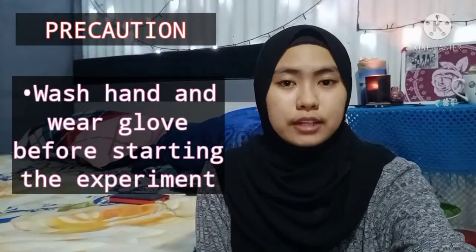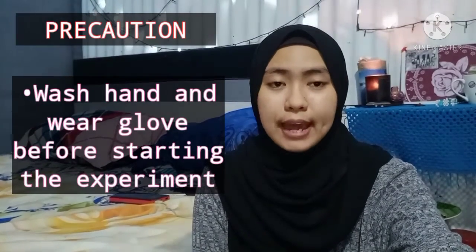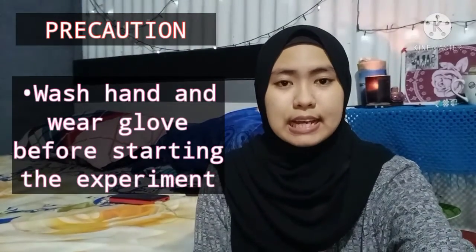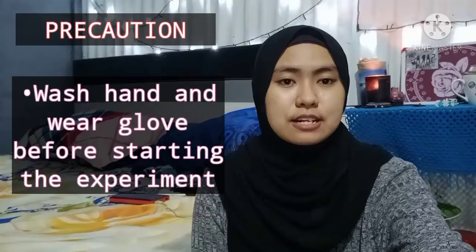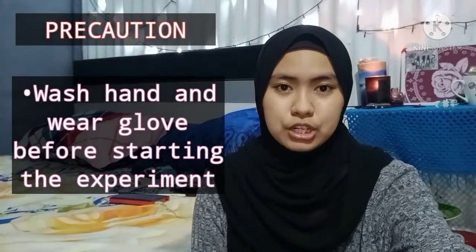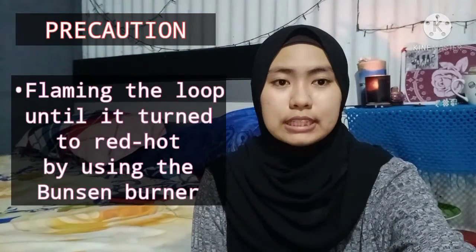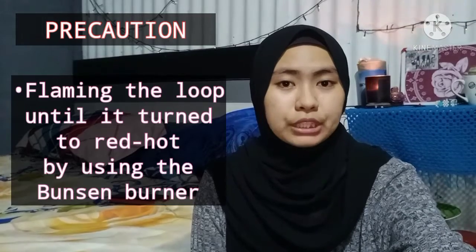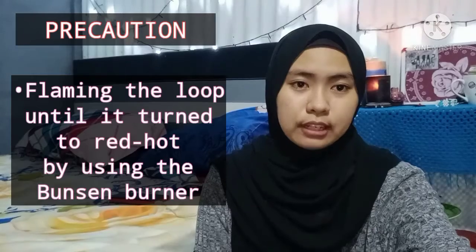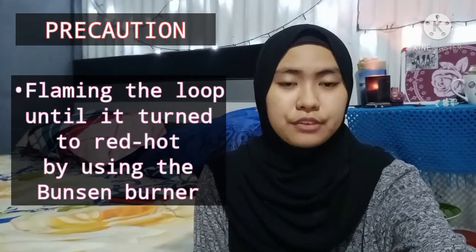So next I will talk about the precautions. Firstly, make sure to wash hands with soap and wear gloves before handling the procedures. This is to prevent the investigators from catching any harmful bacteria and to avoid infection. Secondly is flaming the loop, which is done by holding the loop in the flame of the Bunsen burner until it glows red hot for a few seconds. It will kill all the contaminating organisms and also sterilize the loop.